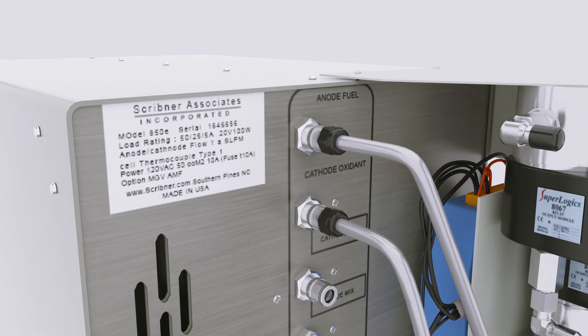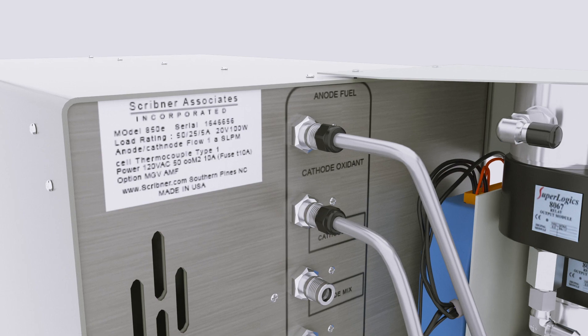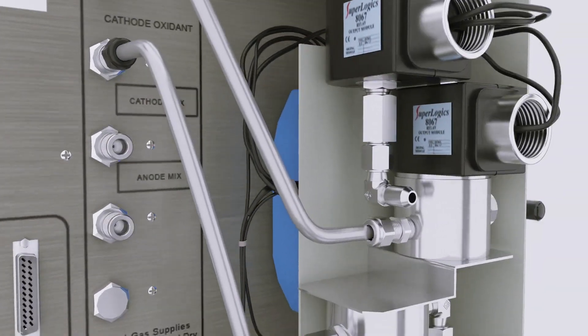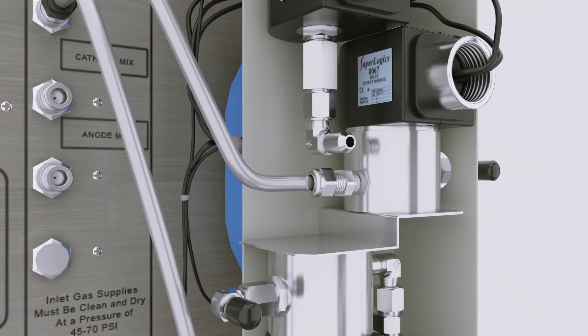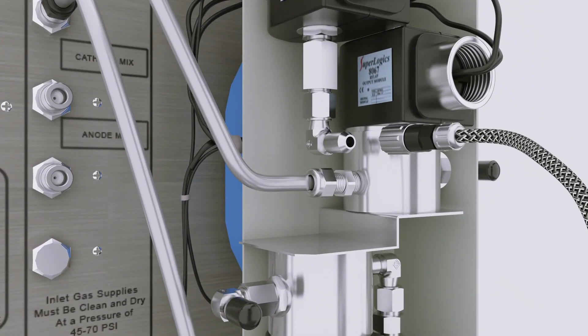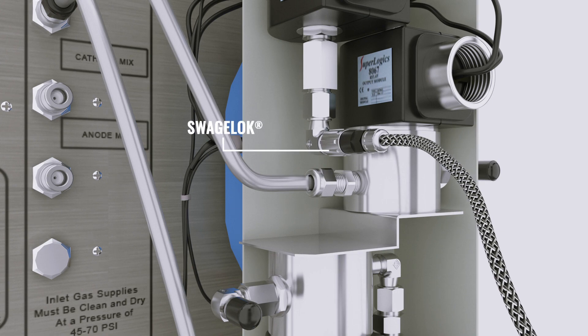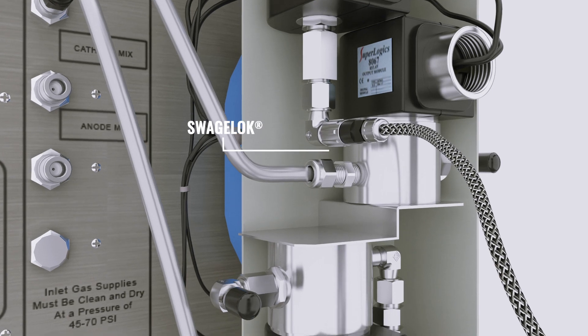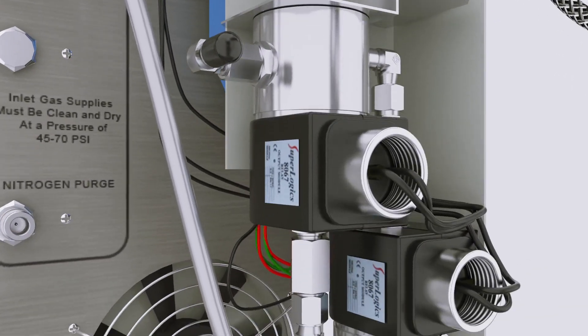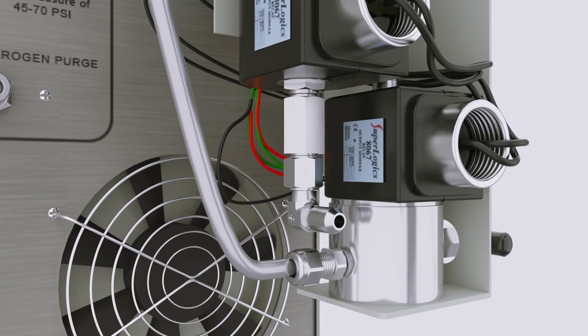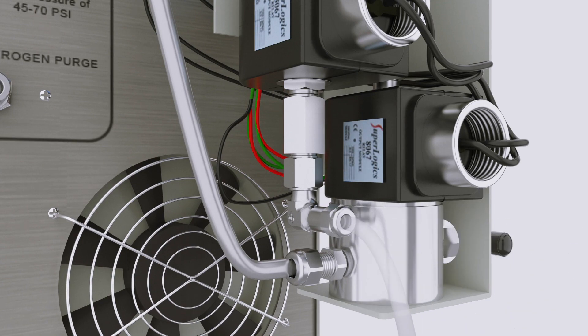Tighten the tubing connections with the provided 9/16th inch wrench. Connect the hydrogen anode supply to inlet port A of the multi-gas valves using a Swagelok flexible stainless steel line. Connect air to cathode inlet port A on the multi-gas valves.